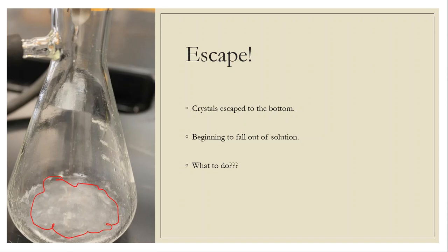But this is no big deal, because the only thing that I'll do is that when I get to the end of this process, I'll just take whatever's left over here in this flask. It's clean. I didn't do anything to it. And I'll just re-pour it through the Buchner funnel. And that way I can capture those extra crystals that did form in the very bottom.